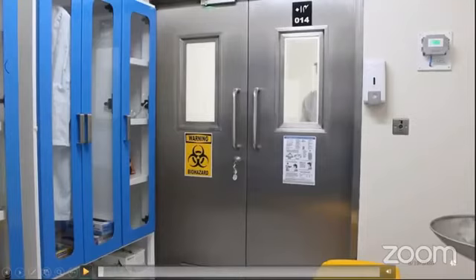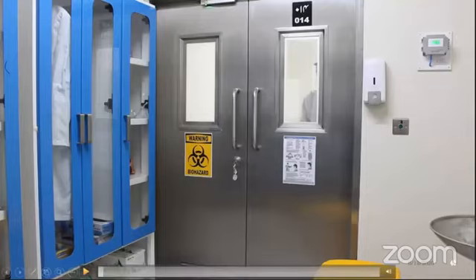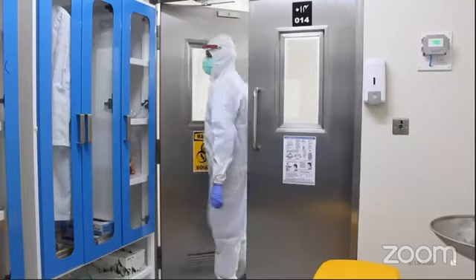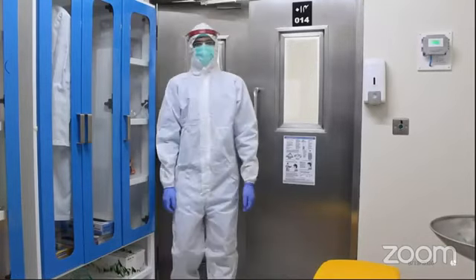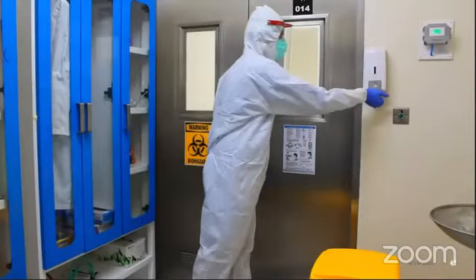Before coming out of the BSL-3 facility, the outer pair of gloves is removed and discarded. He has already removed the outer pair of gloves inside the BSL-3 facility.